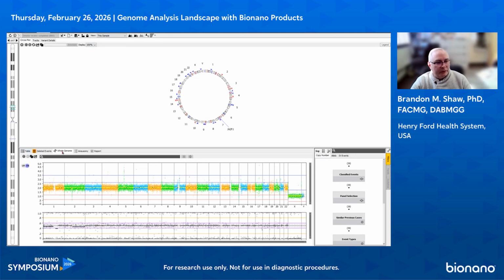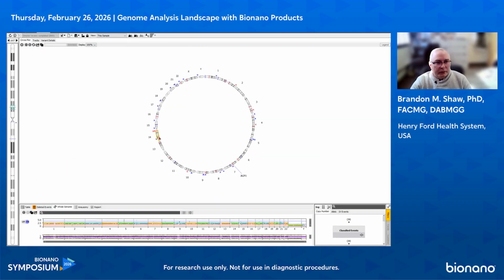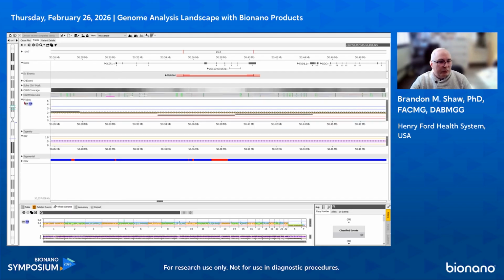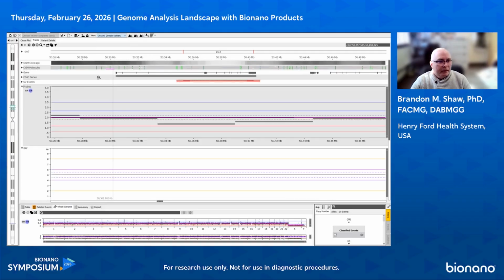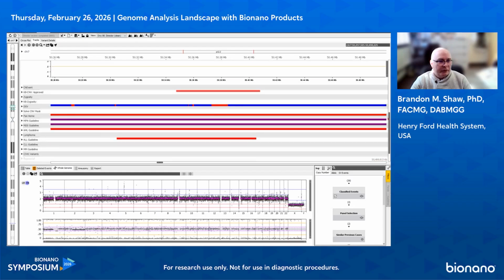And so I can show you that, just real quick. Actually, I need to drop it down to here. So when you're looking at your tracks, a lot of these tracks are provided by OGM to you. Other ones, like I said, you can modify and put in bed files. So for our samples, we have a lot of different tracks that we use.